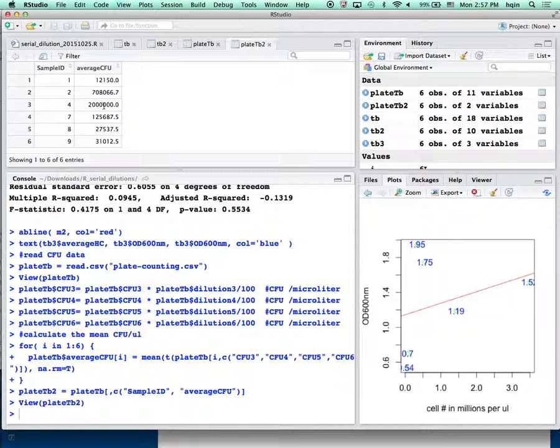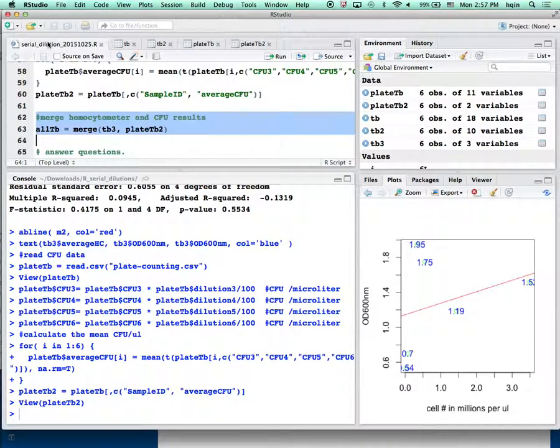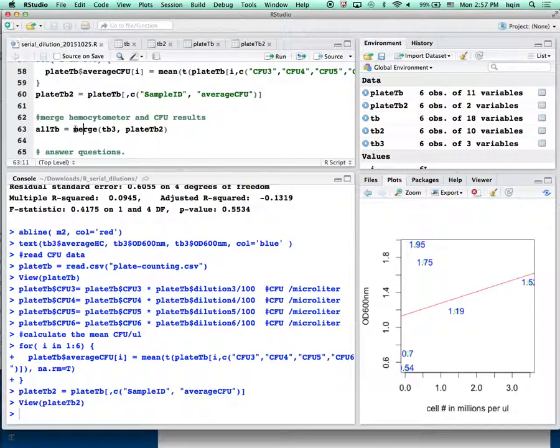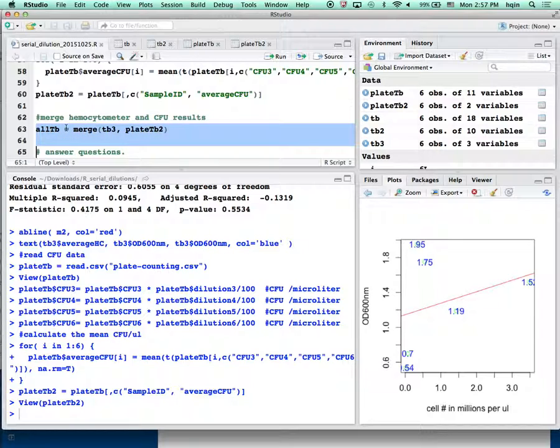Looking at the results for samples 1, 2, 4, 7, 8, and 9 — those are the six strains we used. That's the average CFU — colony forming units per microliter. You can see the result varies about a hundred-fold difference from group to group. So now we have the hemocytometer data and the CFU data, and we want to put these two datasets together using a command called 'merge'.